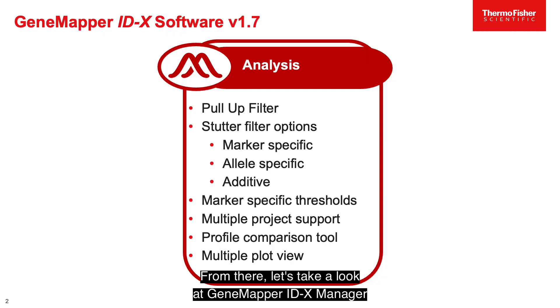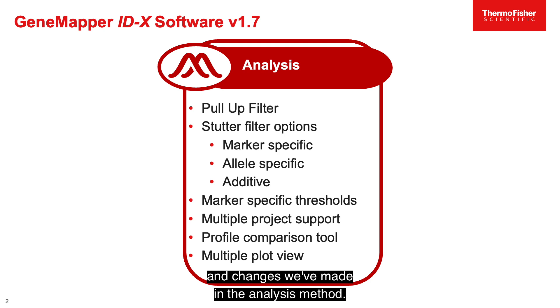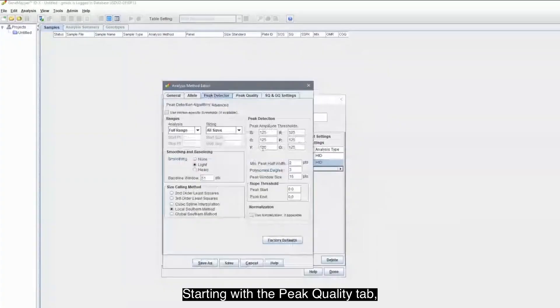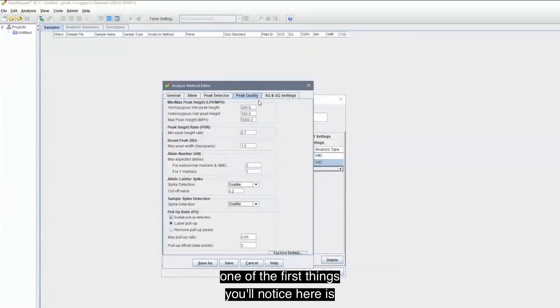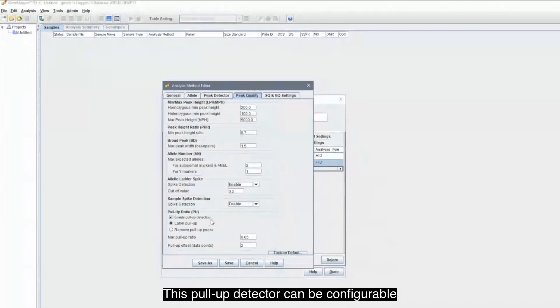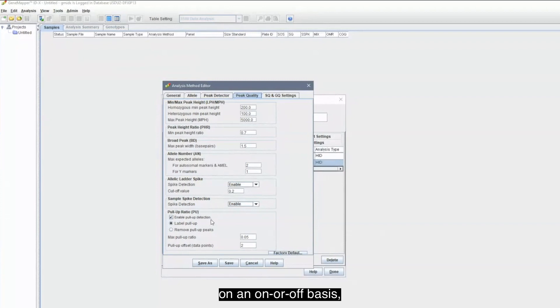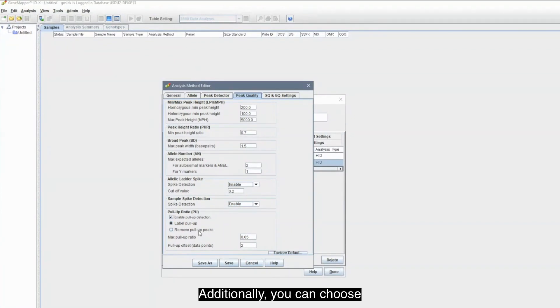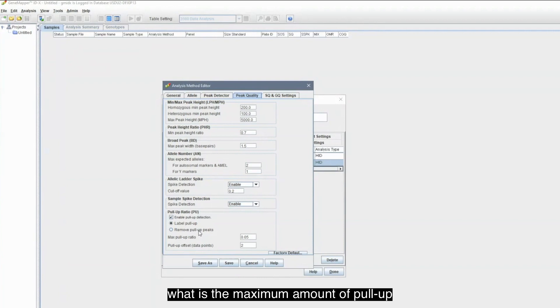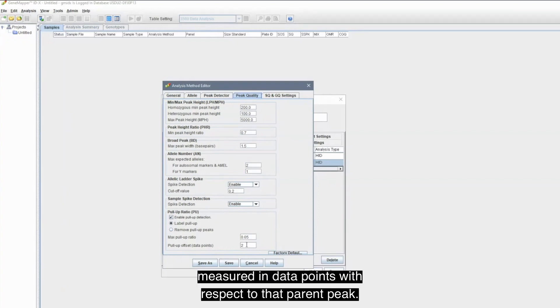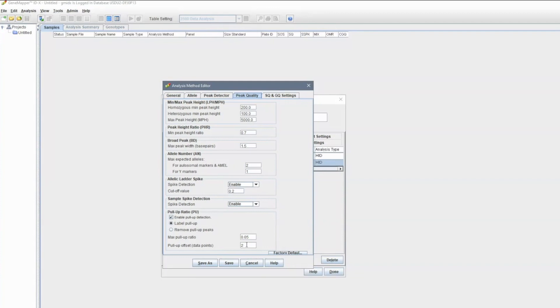From there, let's take a look at GeneMapper IDX Manager and changes we've made in the analysis method. Starting with the Peak Quality tab, one of the first things you'll notice here is we've now added a pull-up detector. This pull-up detector can be configurable on an on or off basis, and you can choose to label your pull-up or completely remove those pull-up peaks. Additionally, you can choose what is the maximum amount of pull-up that you wanted to see or filter, as well as what is the offset measured in data points with respect to that parent peak.